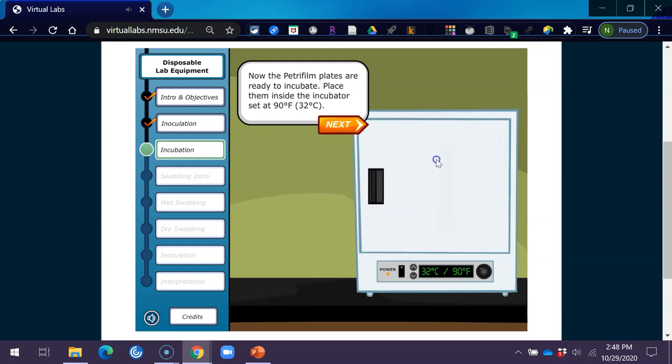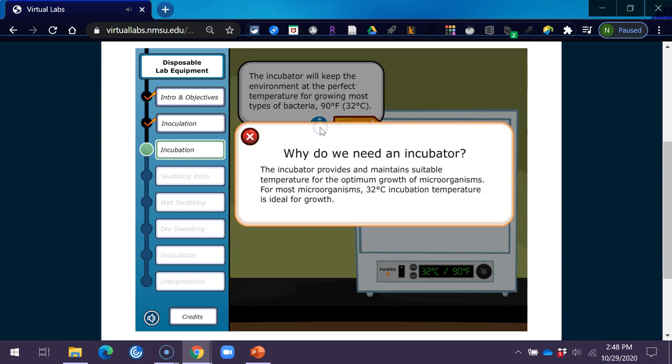Place the Petri film plates inside the incubator set at 90 degrees Fahrenheit (32 degrees Celsius). The incubator will keep the environment at the perfect temperature for growing most types of bacteria. The incubator provides and maintains a suitable temperature for the optimum growth of microorganisms — for most microorganisms, 32 degrees Celsius incubation temperature is ideal for growth.